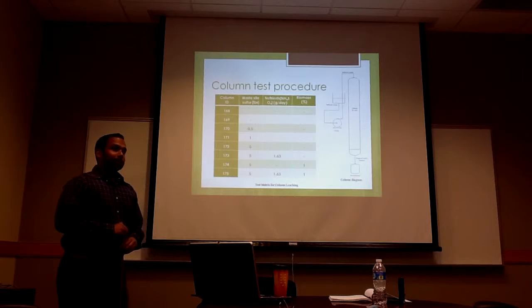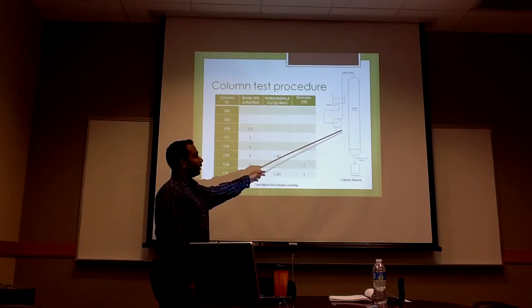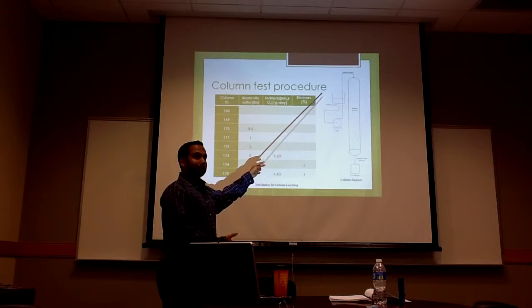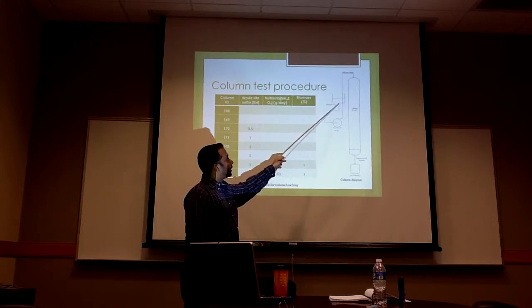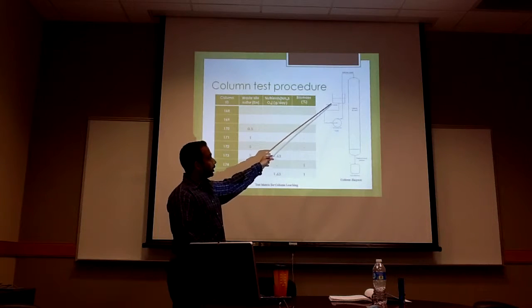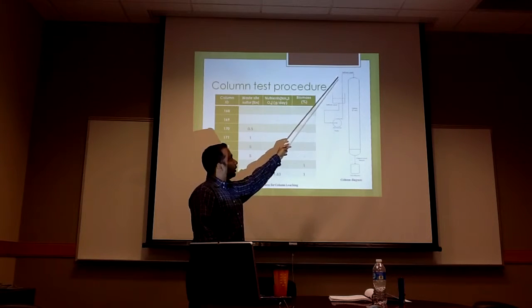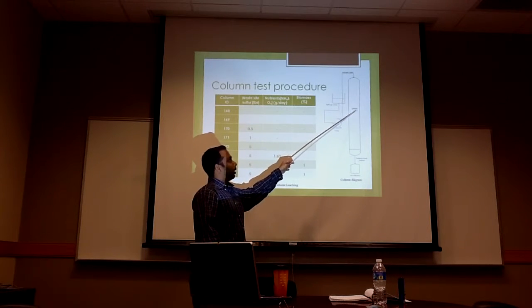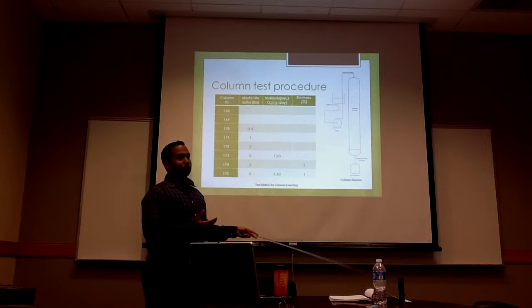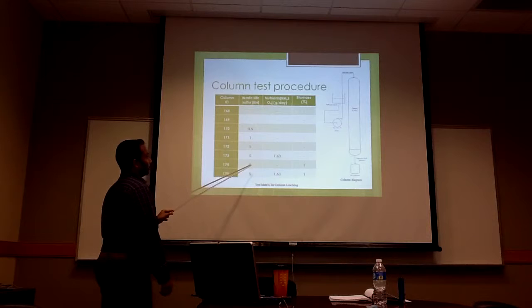Moving on, the third set of tests done is a column test procedure. And what we took here was 8 different columns marked like that. And this diagram basically describes what we did. We take a sample of raffinate, which is the sulfuric acid with ferric ions, from the heap and from the mines, and then we run it through a pump, and it goes into this column packed with the copper ore chalcopyrite and also the sulfur added in this table.